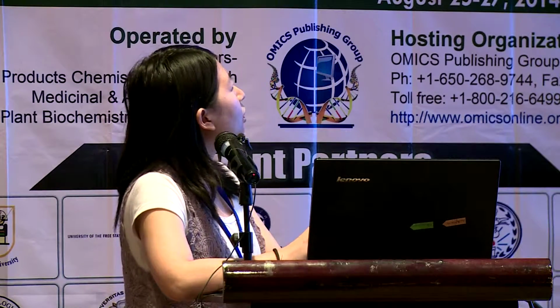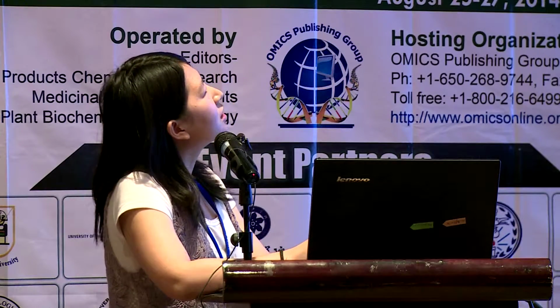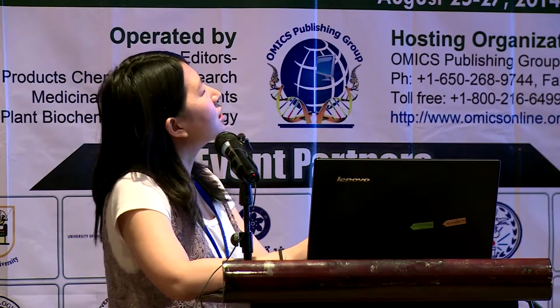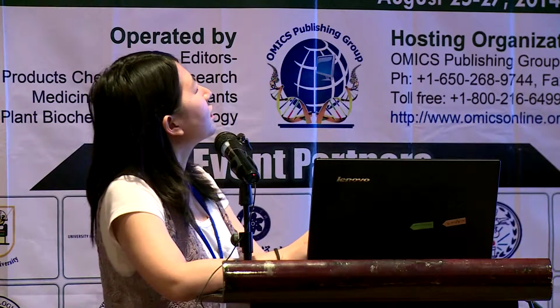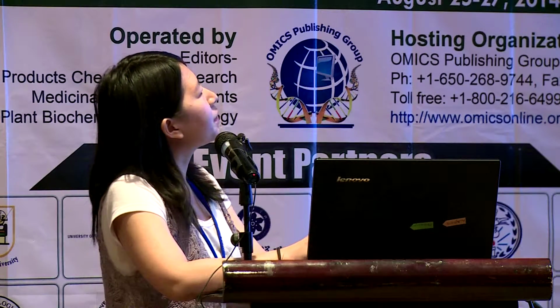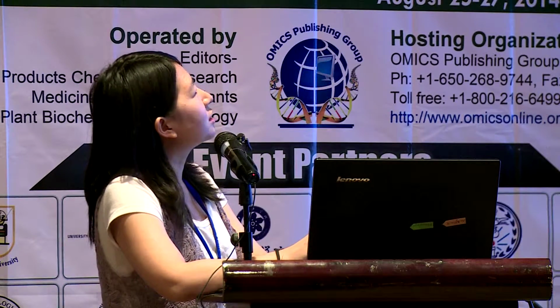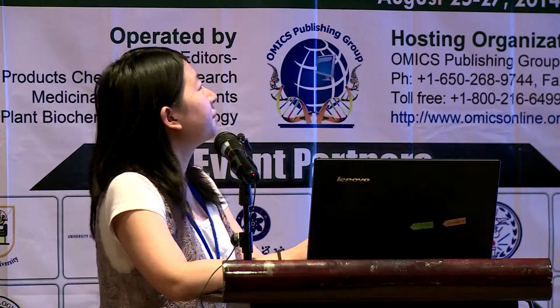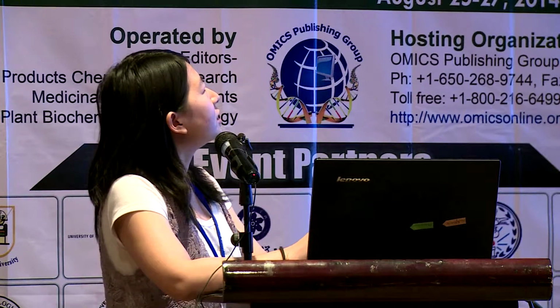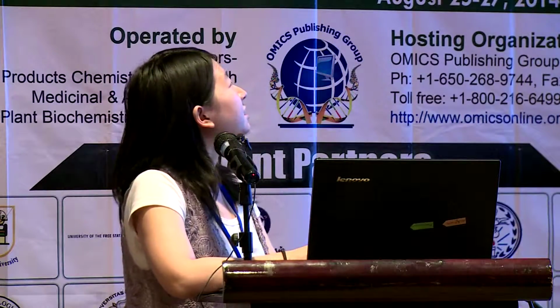and then, all of this is from Lycoris longitubea, a species from the Lycoris, and all the alkaloids will be identified by the software, and also the area of each peak will be calculated like the before method, and every compound will be calculated. And then we get the results.